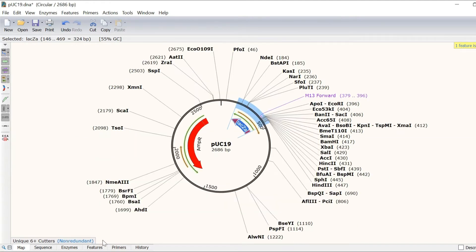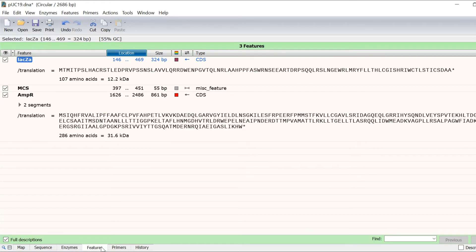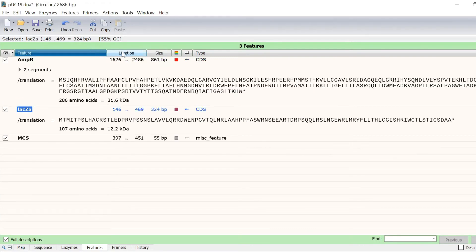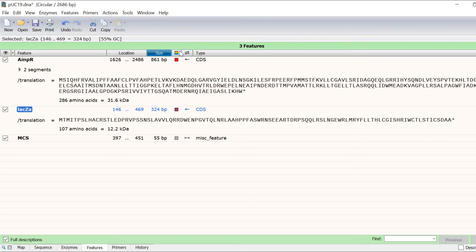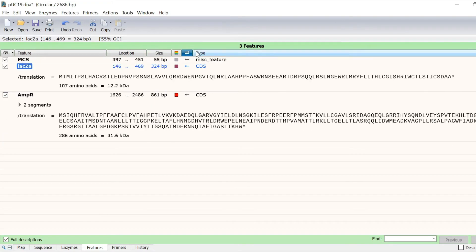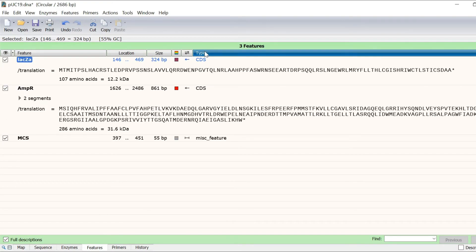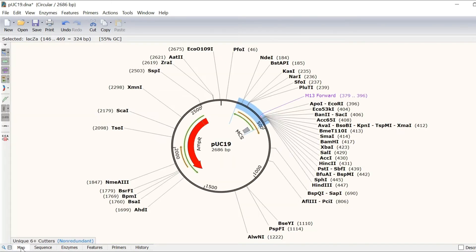By going to the features tab, you can sort the list of annotated features by name, location, size, colour, directionality or type. You can also select the features that you want to be made visible on the map and sequence view.